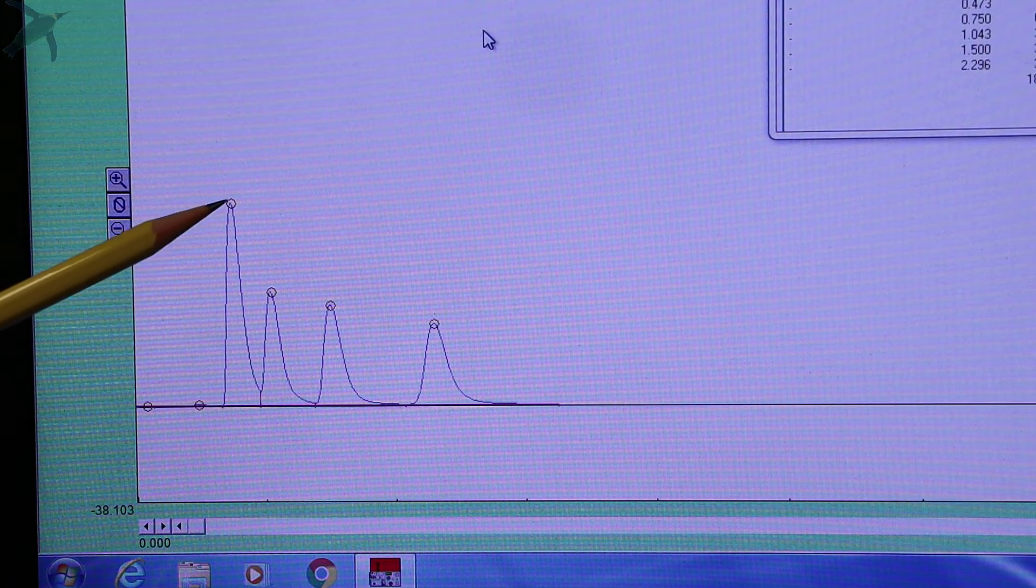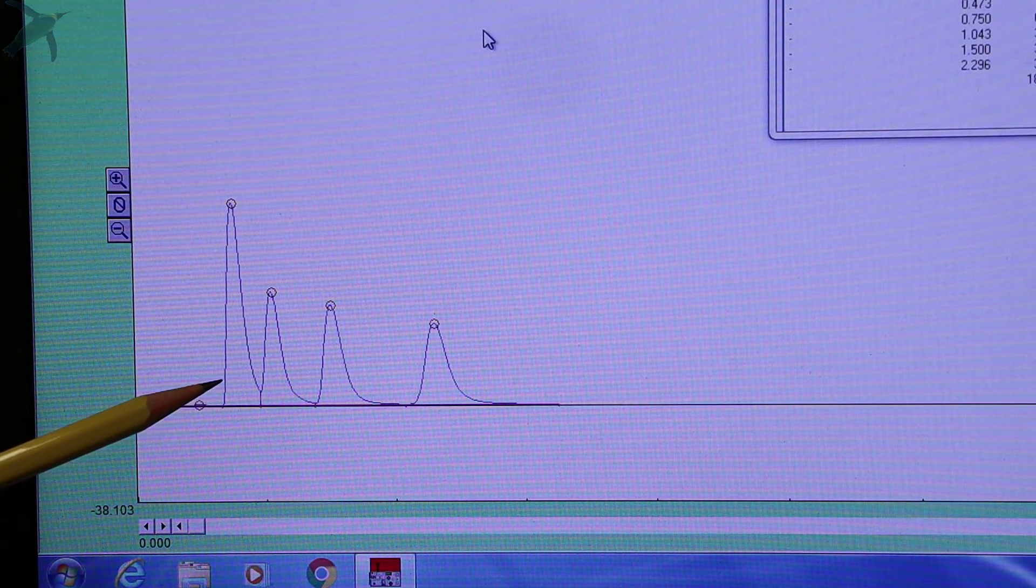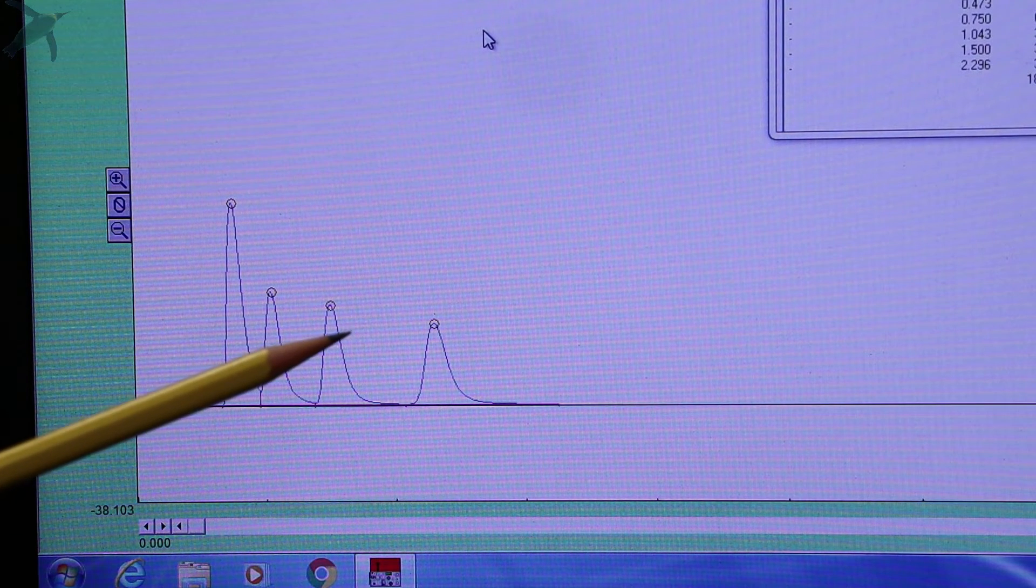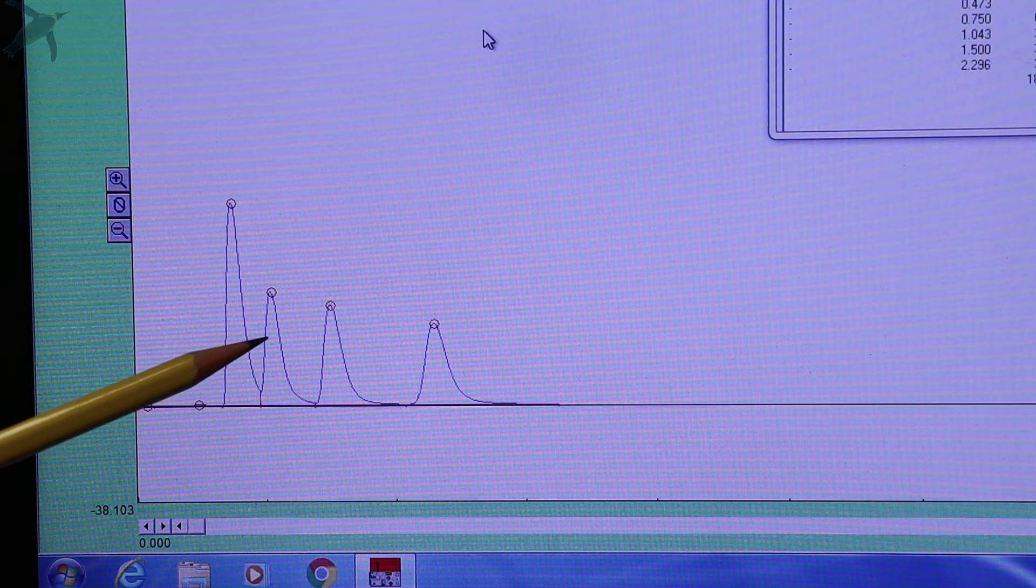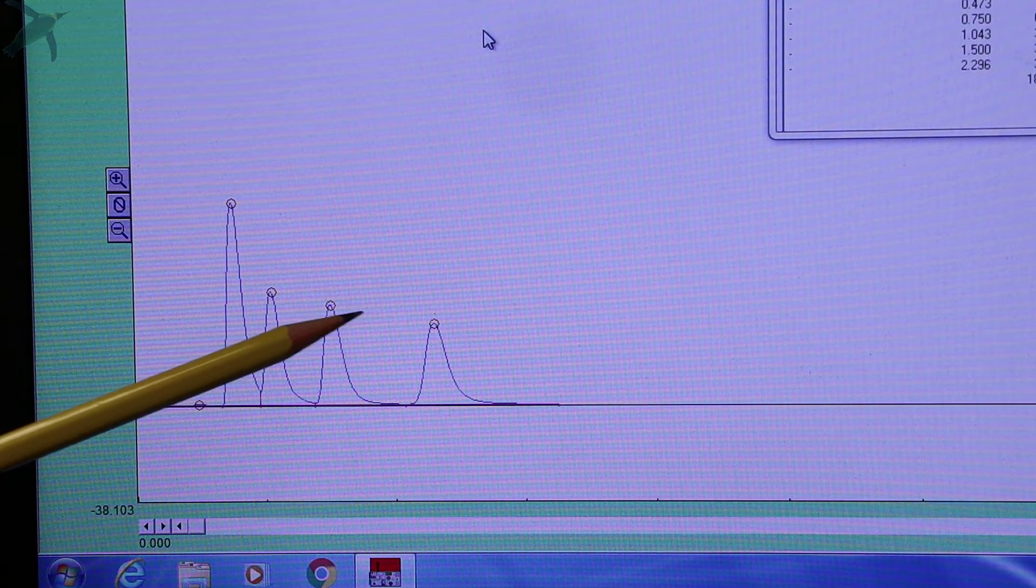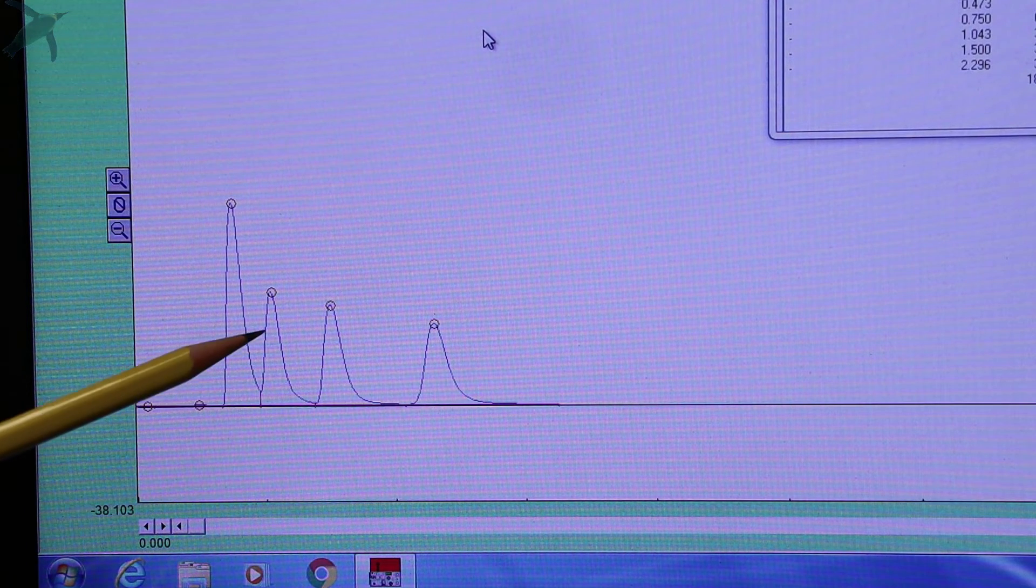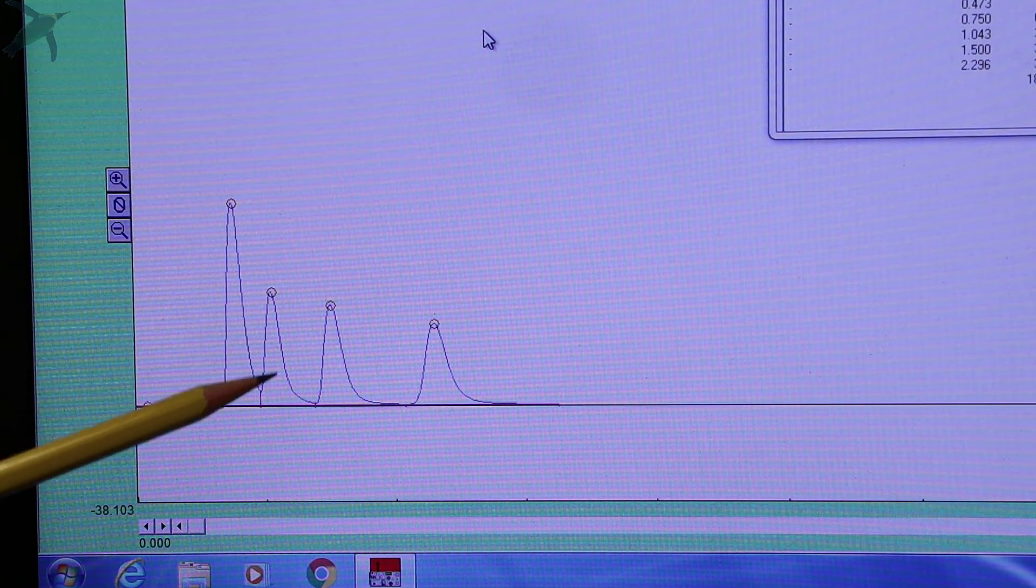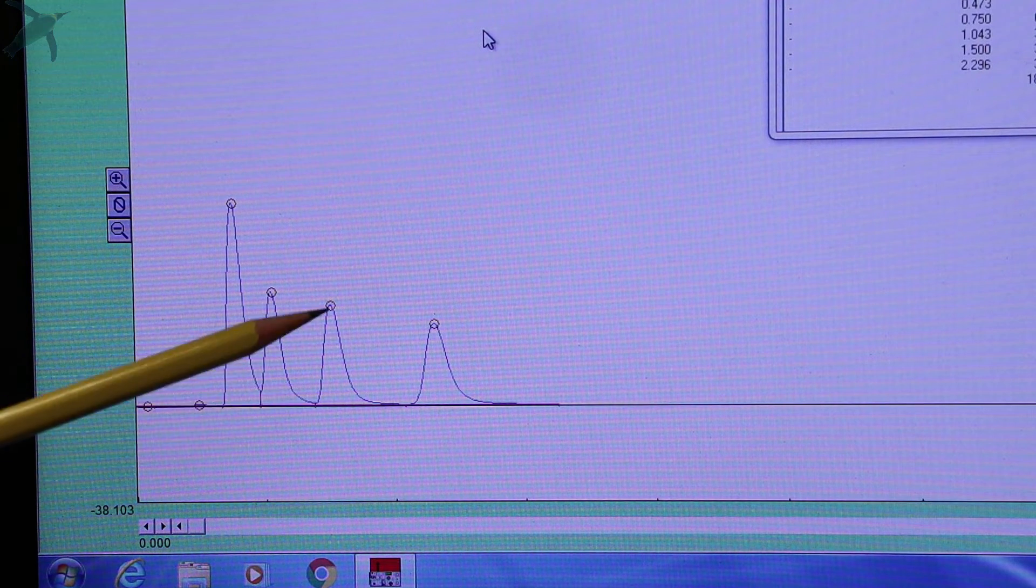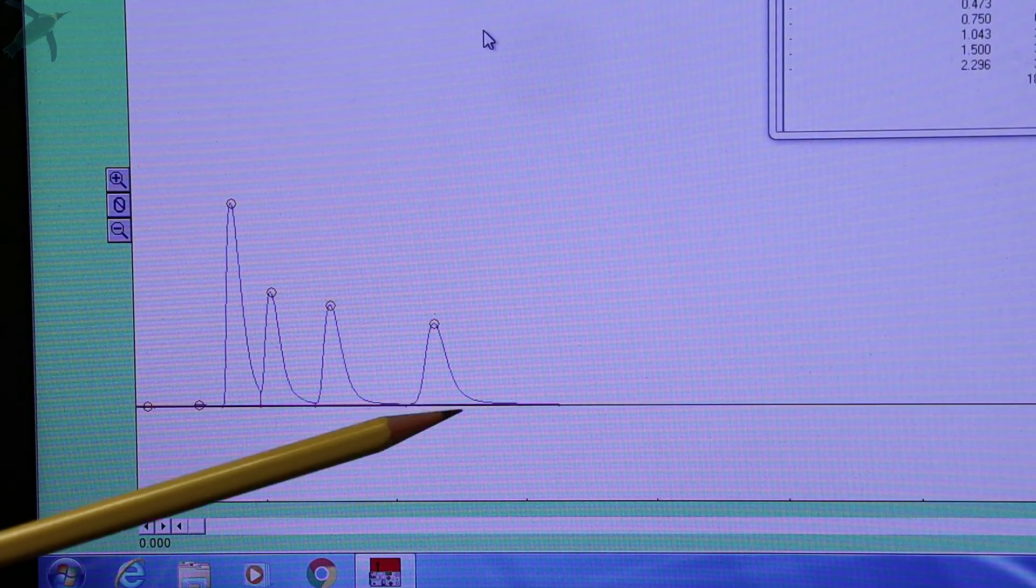If you see, the first peak is ether, the solvent that we use to wash the syringe. Then we have three more peaks. We injected a three component mixture, so that's what we would expect, and they are respectively hexane, heptane, and octane, in increasing retention time. Hexane is the lowest boiling point solvent so it has the lowest retention time, heptane is in the middle, and octane has the highest boiling point so it has the highest retention time.